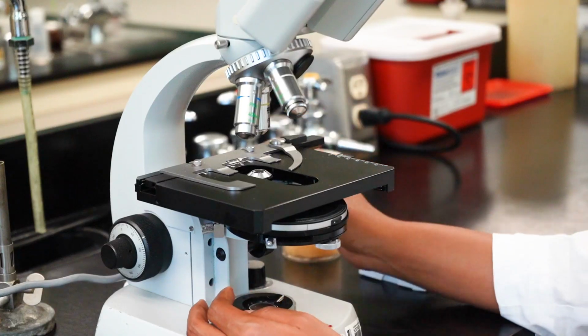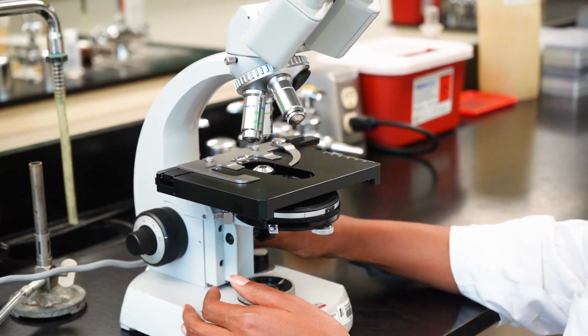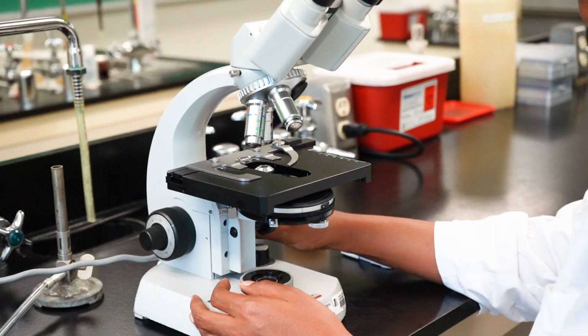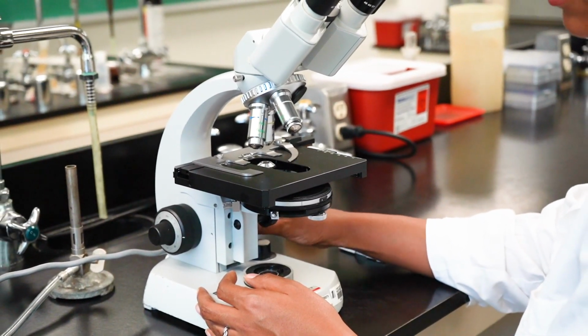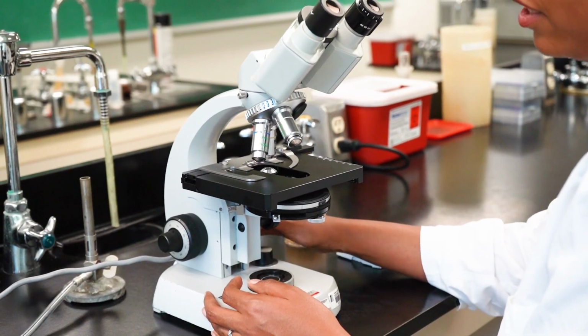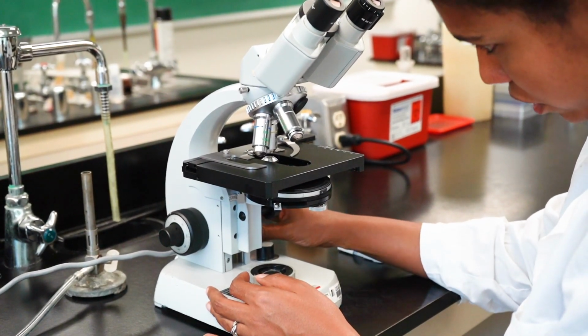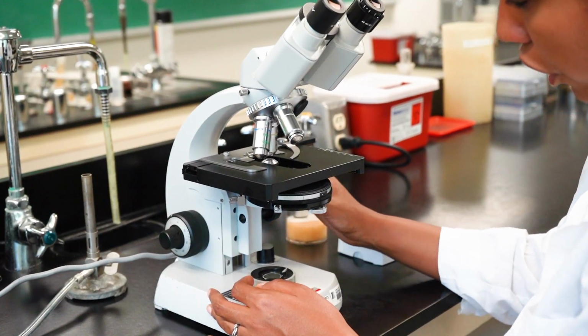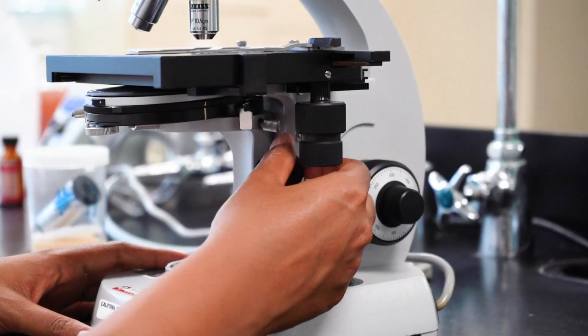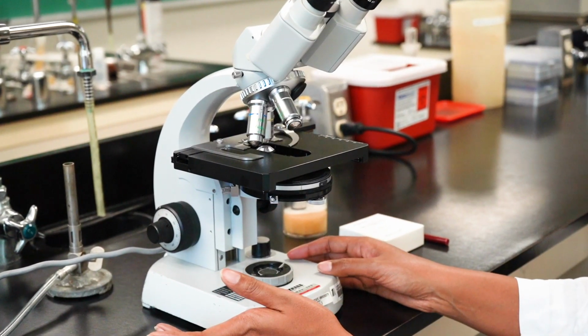The next thing you want to do is raise the stage to its highest position. This is okay because with this objective, the lens and the slide will never come in contact. However, with other objectives, you should never do this. Okay? You're also going to make sure that the condenser is in its highest position, which it already should be if the microscope is stored properly.